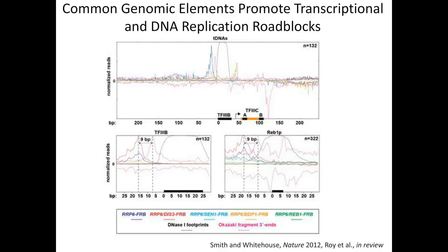And so you can see here, when we map the nuclear exosome targeted poly-A tails alongside the Okazaki fragment 3' ends from the lagging strand synthesis, we can see they map almost directly on top of each other. However, there is a slight difference in the location of the peaks. And so if we look at the TFIIIB transcription factor, which binds DNA upstream of tRNA genes, we can see a 9 base pair difference in these peaks.